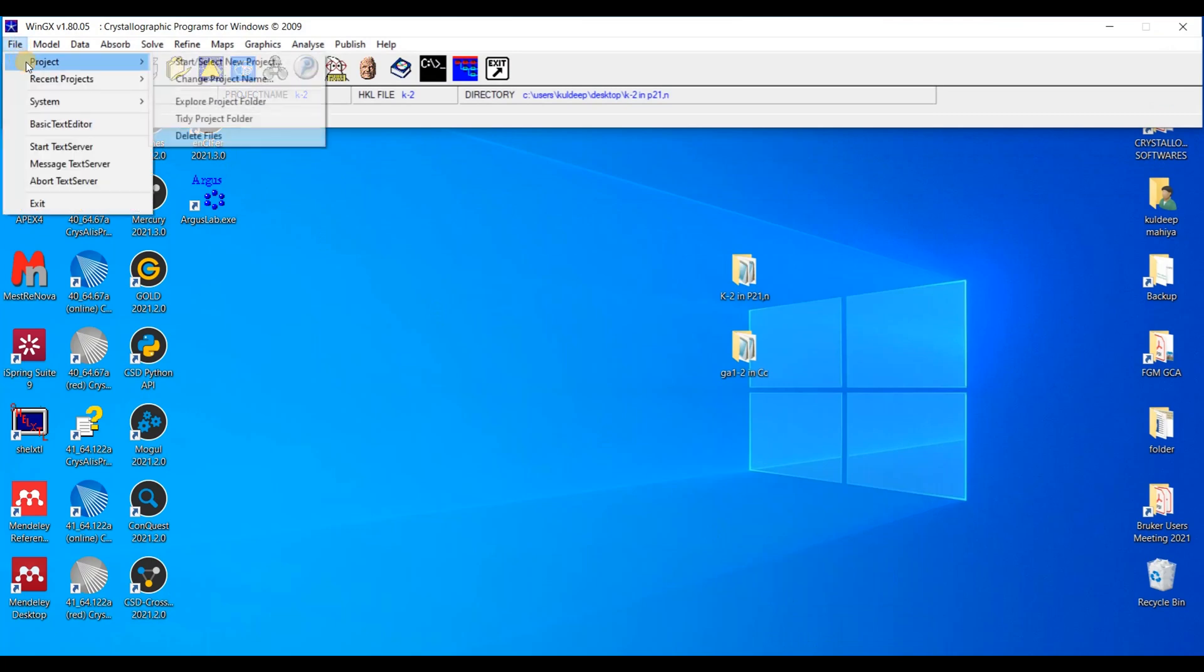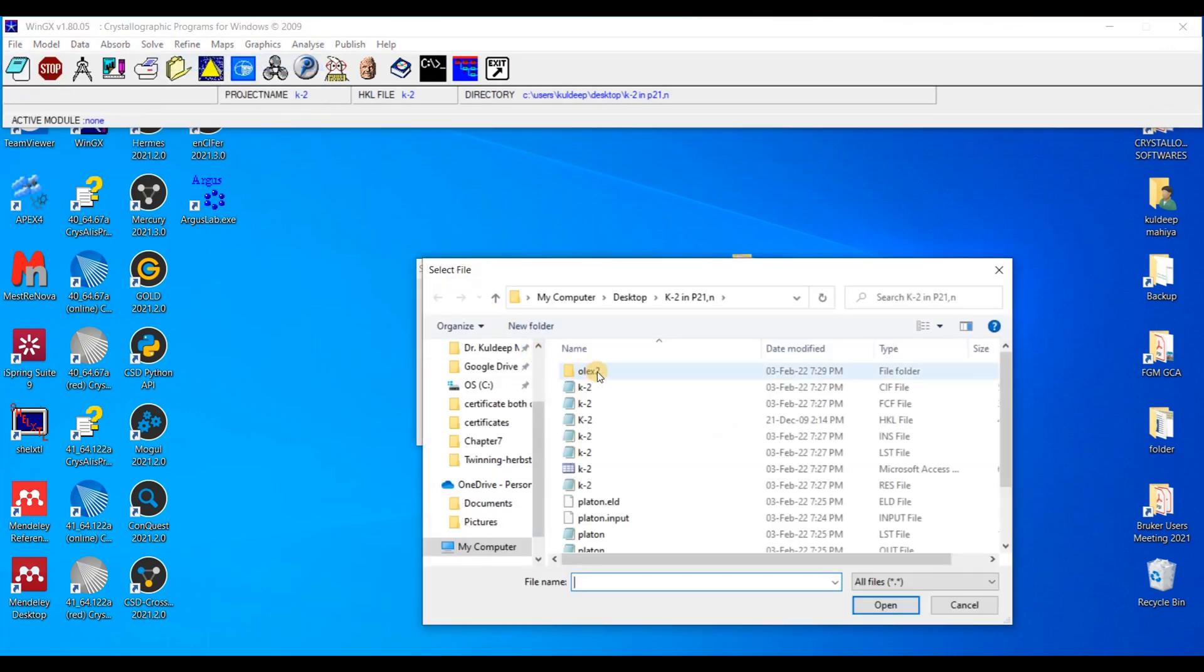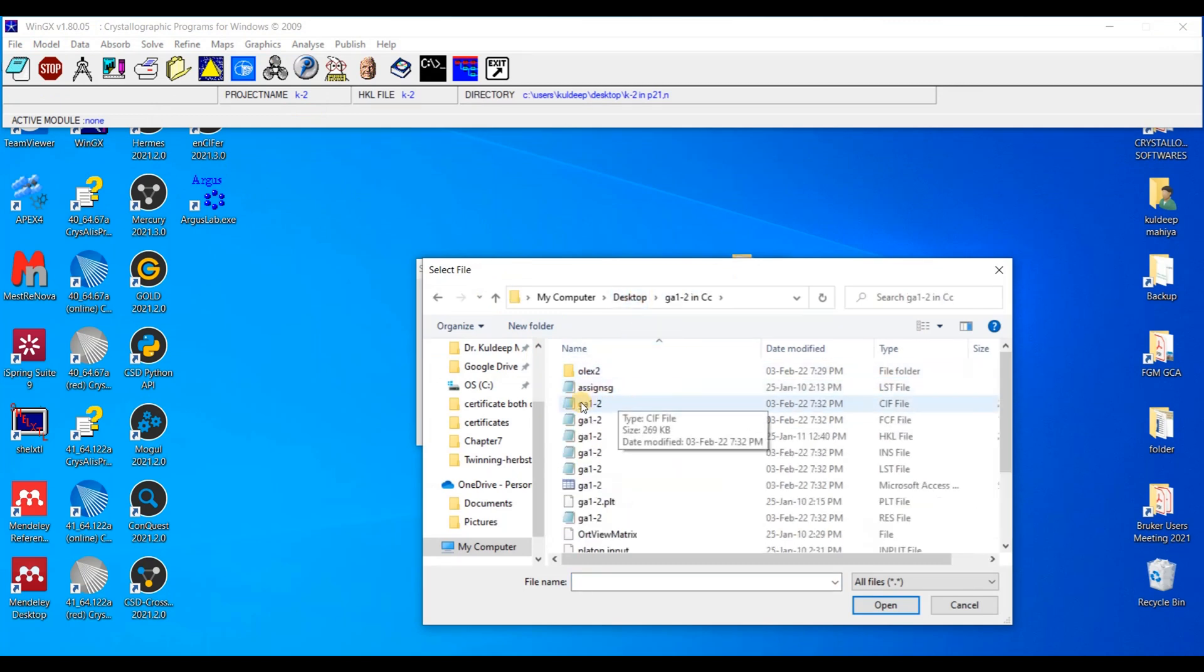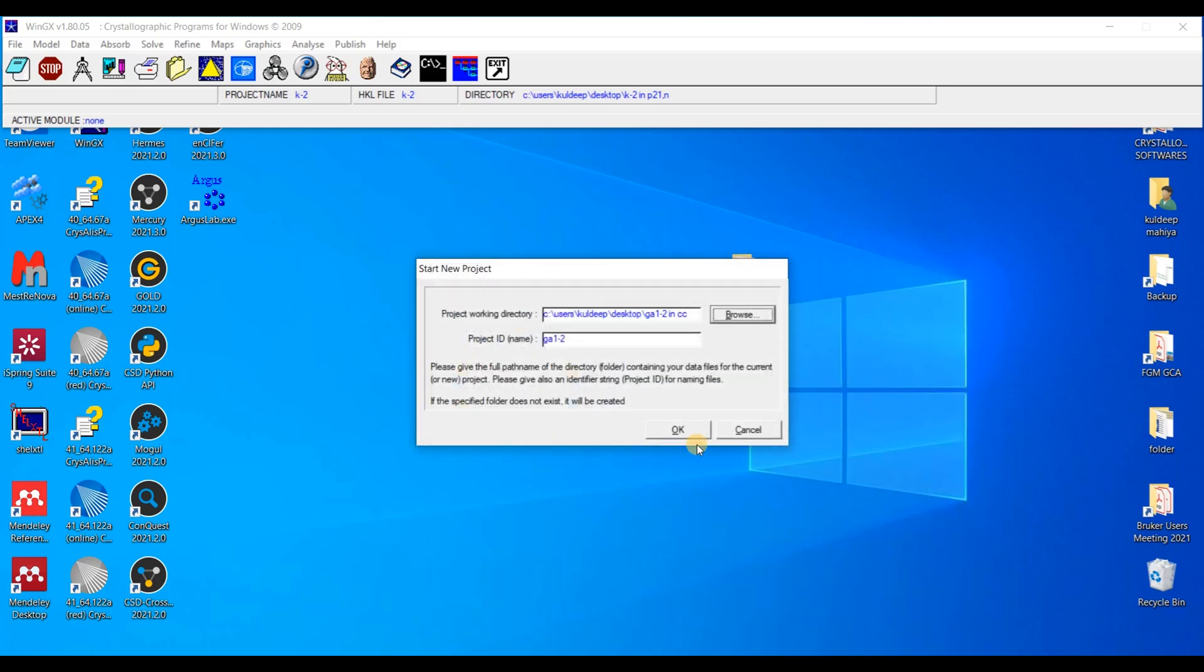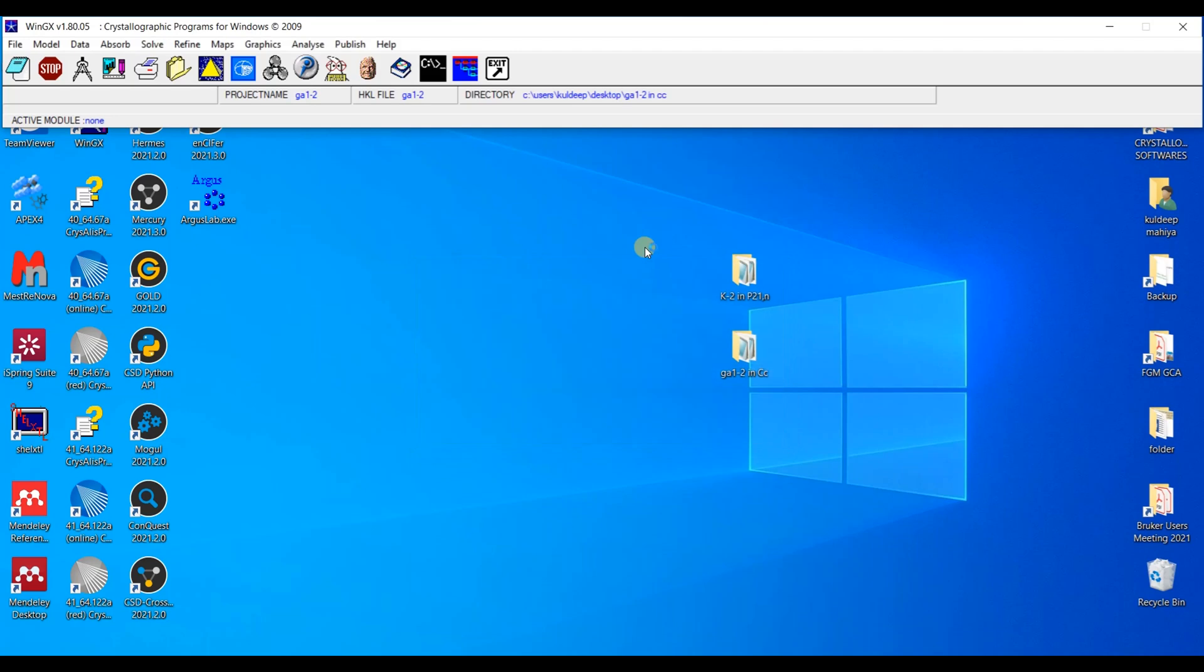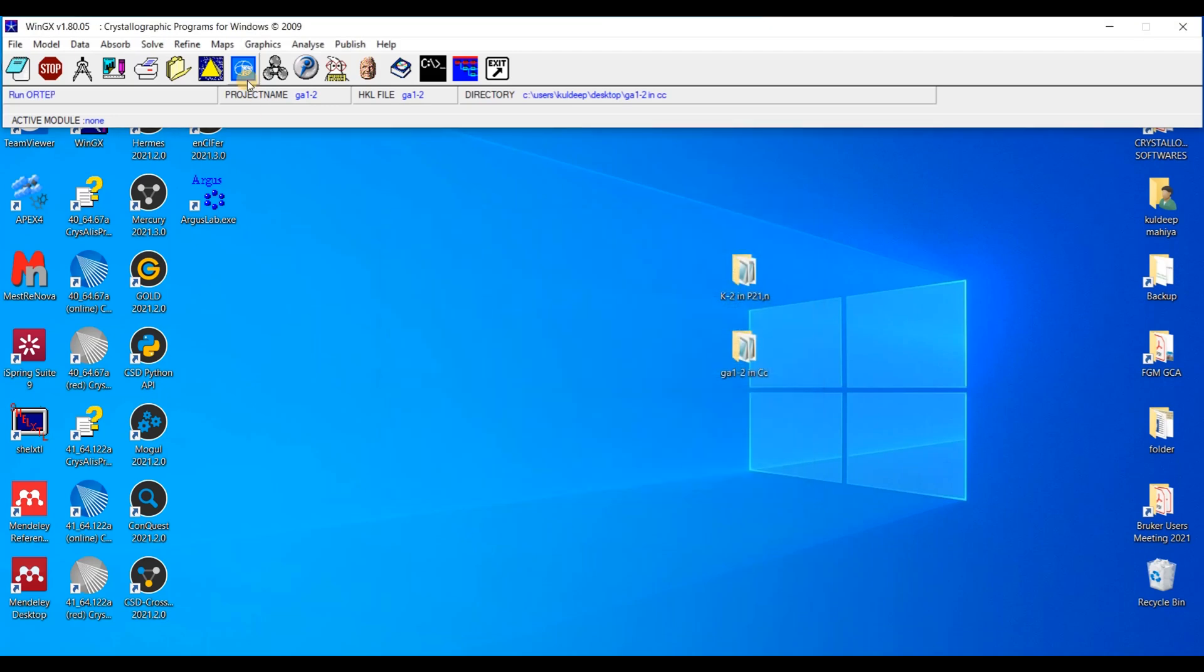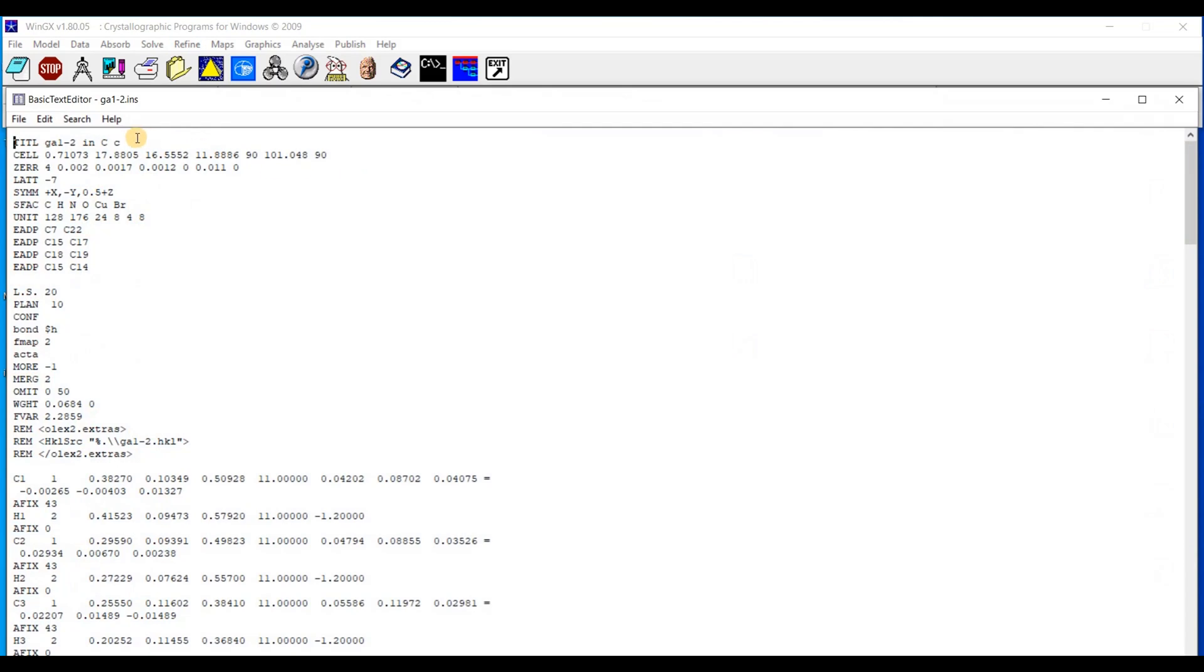And I am going to open the required file. On the desktop I placed this file. And I am going to open the INS file. Open. Okay.